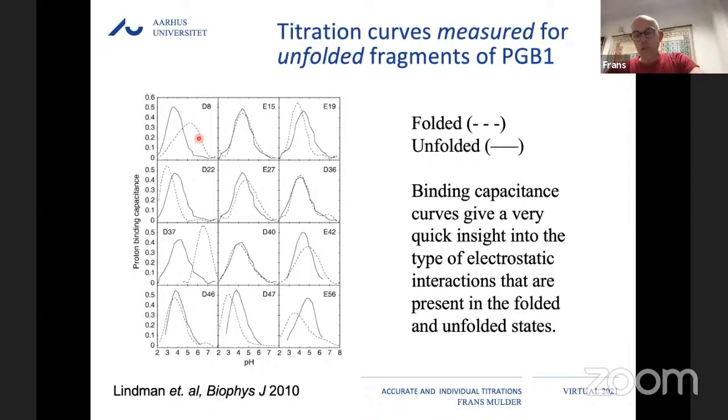So each of these 2-dimensional spectra takes maybe 20 minutes to record. So if you'd like to get this wealth of data, it really can only be used for things that would change very slowly in time. Yeah, it might be very challenging to do the experiments in different ways that would give you a more reasonable time resolution than minutes.